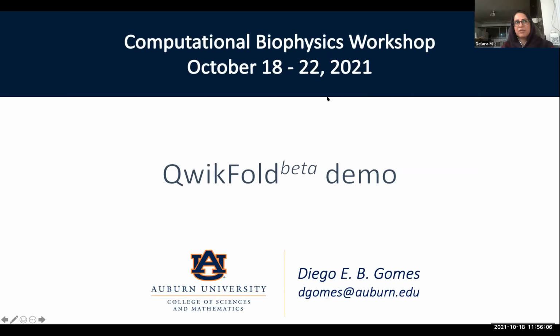Oh, so, for example, when using GROMACS, the challenging part is to have a good topology, or I mean force field file. I want to know, for example, with QuickMD, is it easier now to have this PSF file in comparison with, for example, using NAMD in the traditional way? So, okay. Hasn't anything changed in this respect? There are a few ways you can get a PSF file, and maybe let me explain that way. Okay.